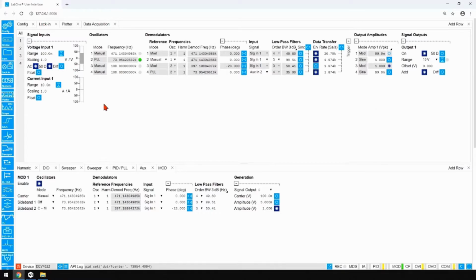So here for the heterodyne, we see that we are now locking to the shaker, so to the mechanical phase of that tapping mode frequency, coming from the shaker, from the controller. And we want to excite at F1 minus F0. For this, we need to use this modulation option, where we can configure our sidebands to be equal to F1 minus F0.